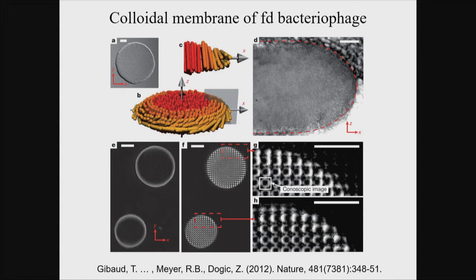And at the edge, because they have a tendency to twist against each other, which they can't really do in the bulk, at the edge they can twist. You can, in fact, see that very nicely in these light field images. So that's a direct application of this.